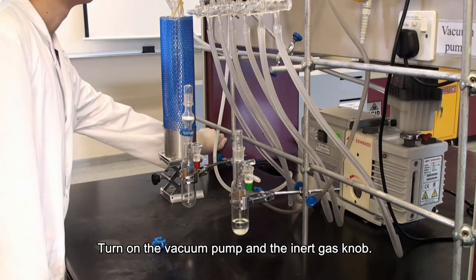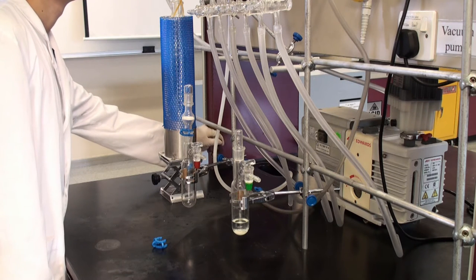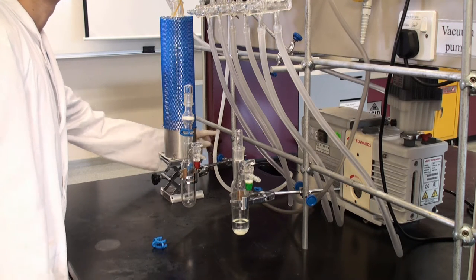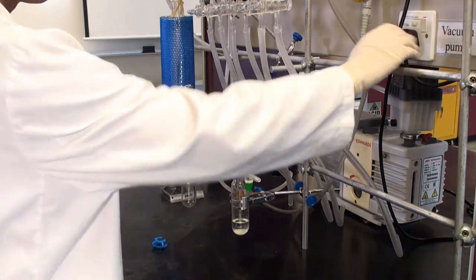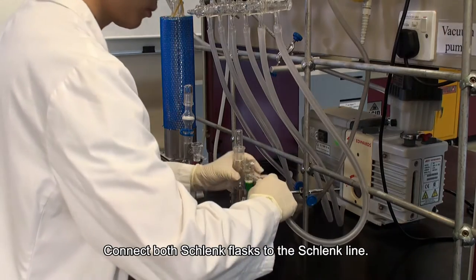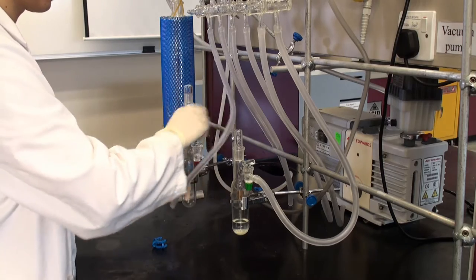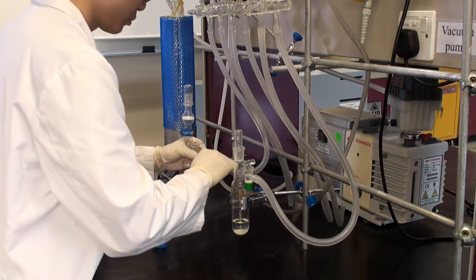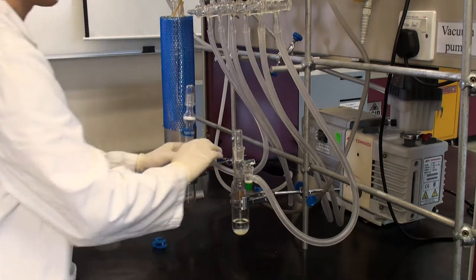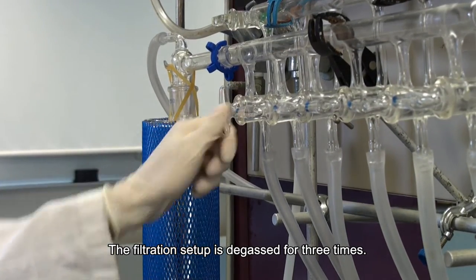Turn on the vacuum pump and the inert gas knob. Connect both Schlenk flasks to the Schlenk line. The filtration setup is degassed for three times.